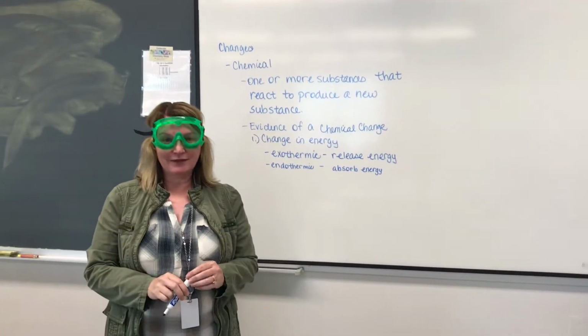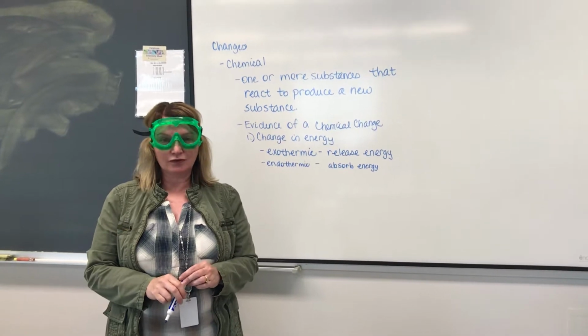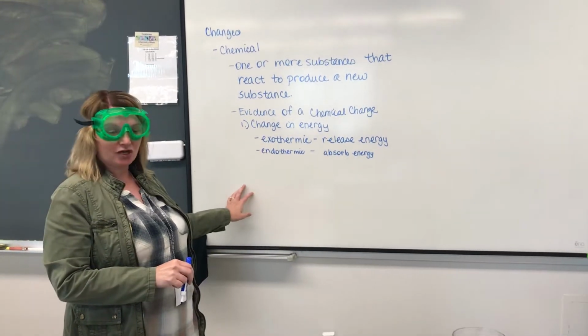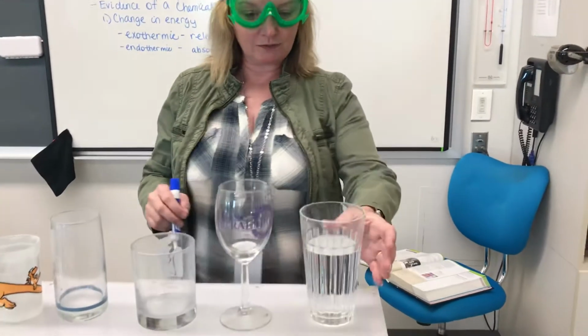All right, let's wrap up our discussion of chemical changes. So I have one last demo to show, and as we go through the steps of the demo, we'll talk about how we're going to add to our list of evidence of a chemical change. All right, so we're going to start on your right.